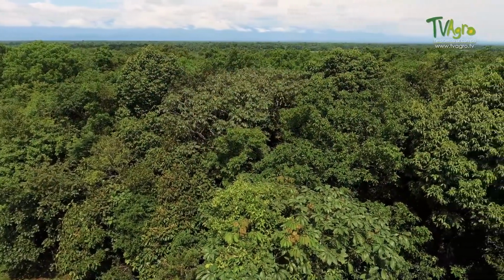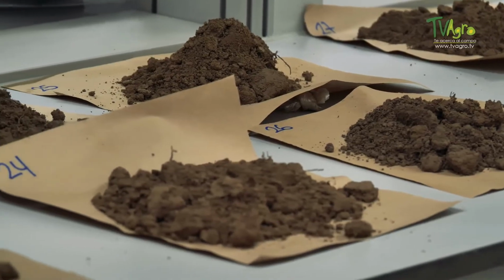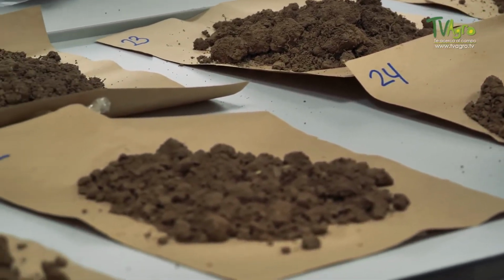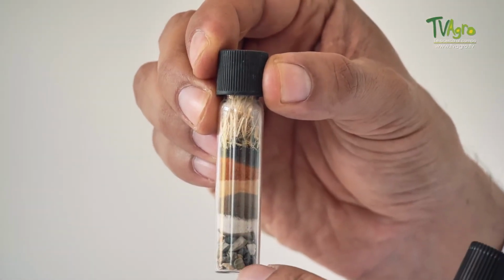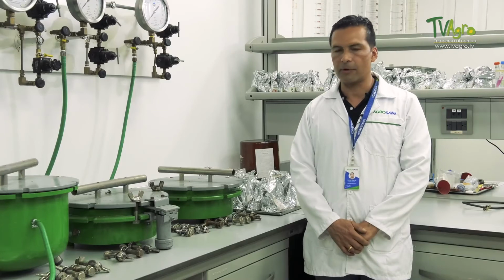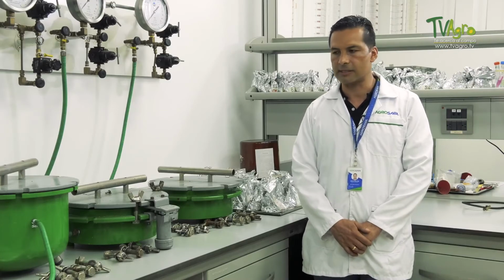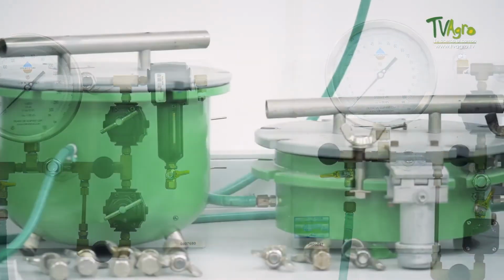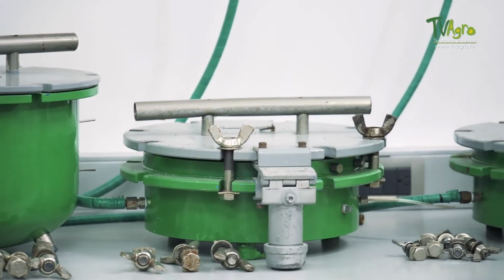At this moment we are in the soil physics laboratory of the laboratory unit, and in this soil physics laboratory we have the possibility of doing some of the tests that are important to determine if a soil fulfills its purpose to support a crop or not. Among the physical tests that we can do in this laboratory unit is the determination of soil moisture retention capacity, which is done with the equipment we have here.